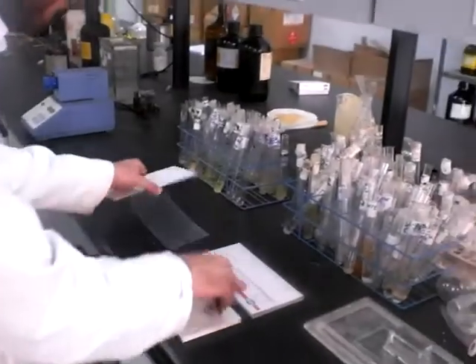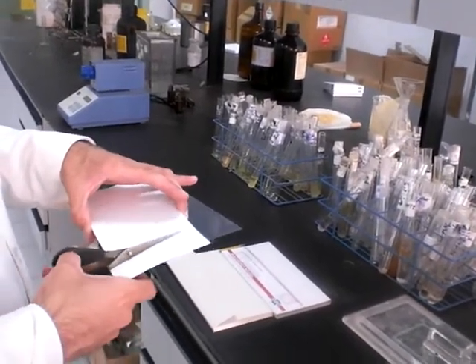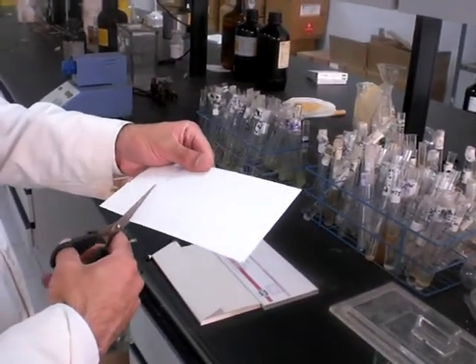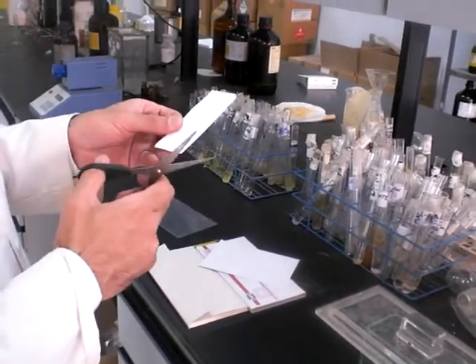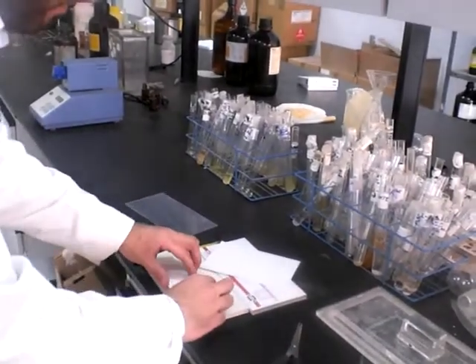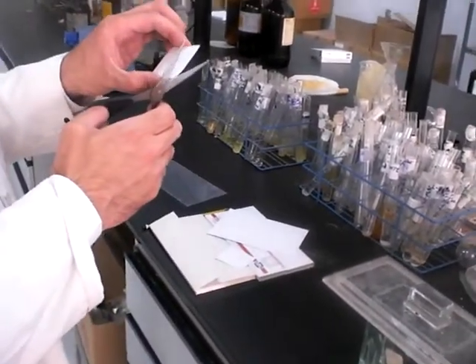Here we have an aluminum sheet of TLC, so you can cut the piece you wish, with the size you wish, as well. Here the silica is bound tightly, so don't be afraid of losing any part of the silica. We just want to know if the reactions happened or not.